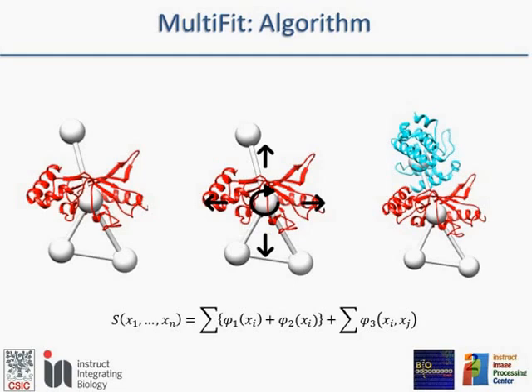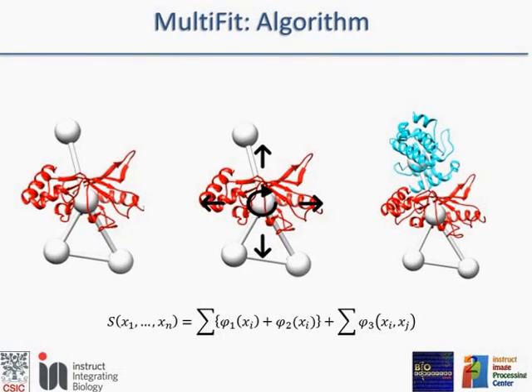And this last term is trying to evaluate the edges, how well these two structures fit. It takes into account the atomic structure, not the density maps, of these two subunits. What it's doing is calculating distances between atoms and finally producing a score depending on whether I have a lot of atomic clashes, and whether the distances between atoms make sense in terms of protein-protein interaction.